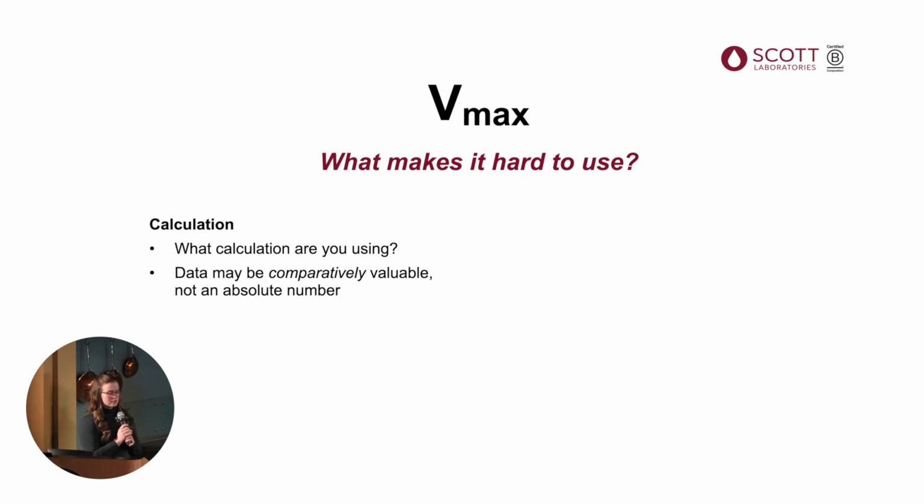So why is Vmax not an absolute number? Well, we're extrapolating a lot, and that leaves a lot of room for error. So Vmax makes a lot of assumptions about 600 milliliters of wine. So it doesn't take into account your pre-filtration. So if you have a lenticular in line or you have a pre-membrane cartridge, you're going to make that filtration quite a bit easier. So that number that Vmax gave you, you're probably going to get a lot more through those cartridges. And then we also have the R2 law, which is basically Vmax uses this filter surface area of the disc, and mathematically it scales that filter surface area up to the filter surface area of a cartridge.